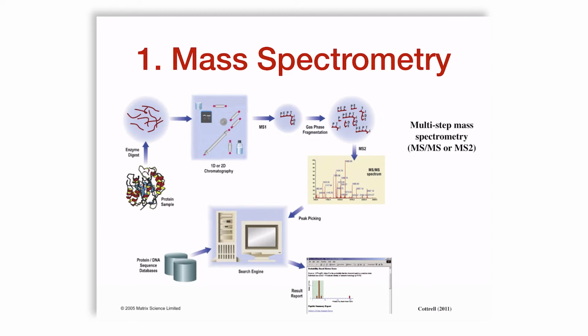By quantifying the amount of protein isolated, you can quantify its amount and therefore its concentration also, and therefore its abundance in molar units.